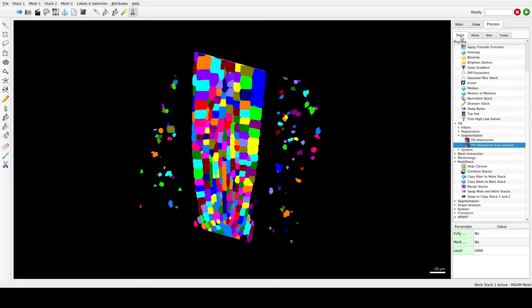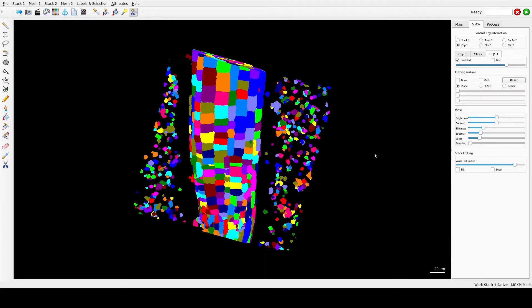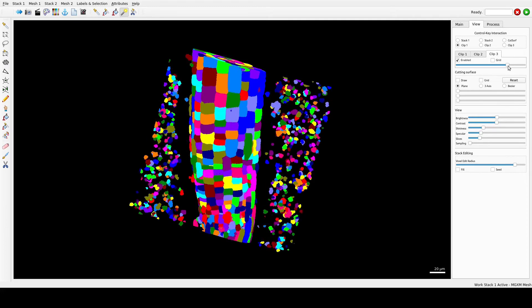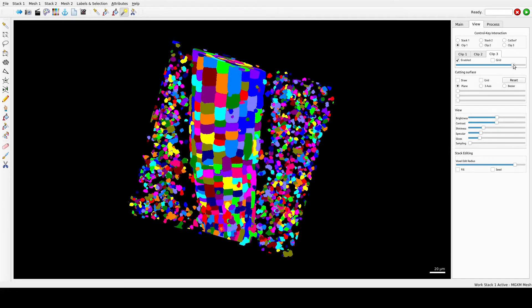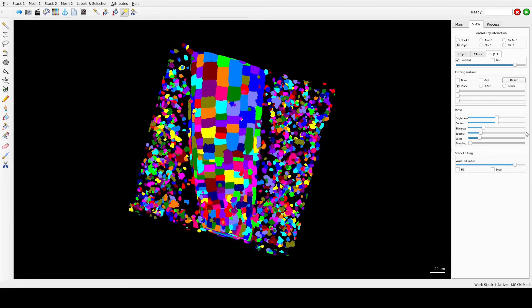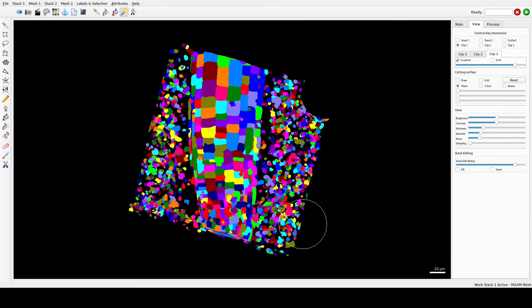Now you can see your sample. The auto-seed segmentation almost always requires some correction. First, we can remove these extra particles with the Voxel Edit tool — increase the voxel edit radius and just get rid of them.